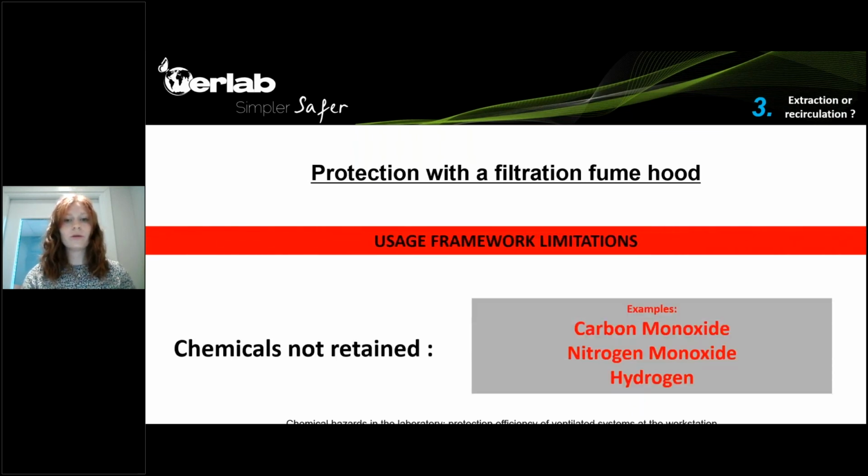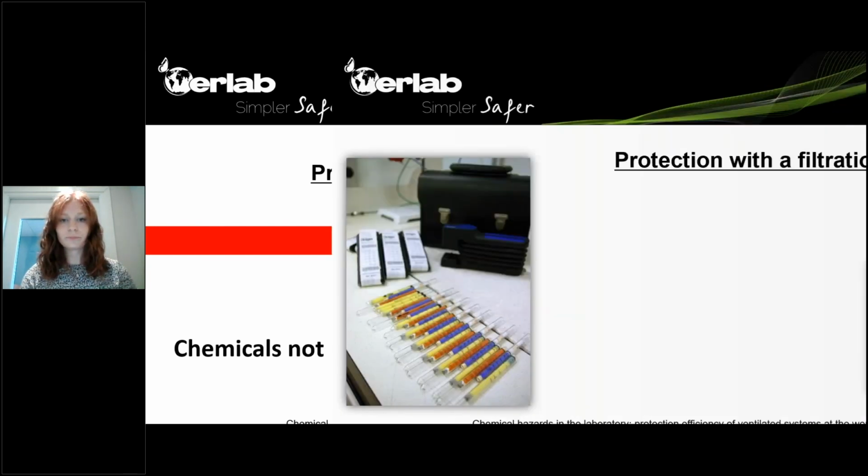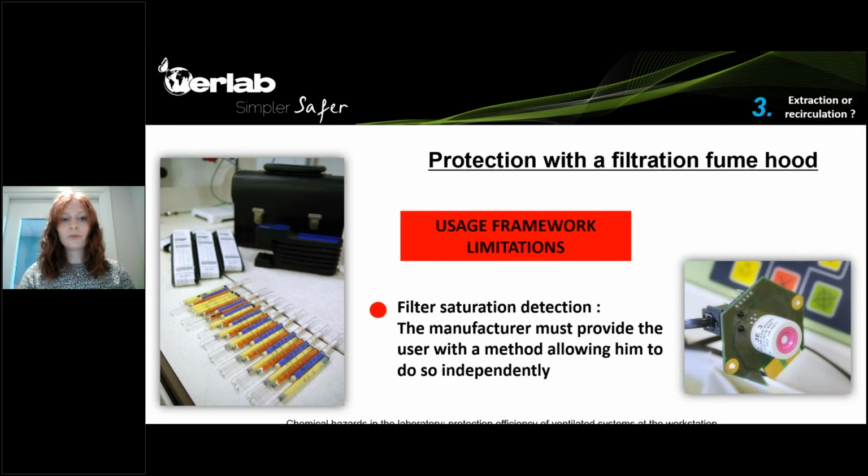The limitations of ductless fume hoods are that not all chemicals are trapped by the filters. There are some chemicals that are not retained by activated carbon filters. Some examples are carbon monoxide, nitrogen monoxide, or hydrogen. In this case, you will not have protection from a ductless fume hood. On top of that, filters do get saturated, so there's a need for detection of this saturation.